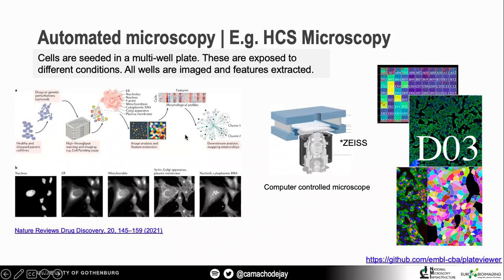I'm not going to go into data mining, all right? My purpose here is also that perhaps we can bridge the different communities: the biologists, the image analysts like me, but also all the bioinformaticians that are very good at data mining. And perhaps this could be a way of introducing the topic so that people get to know what type of images and what type of data we have in microscopy.